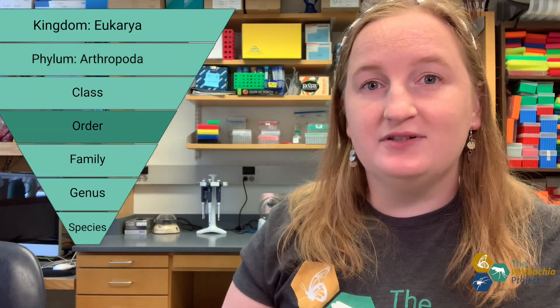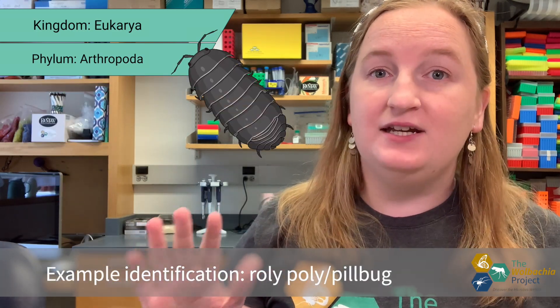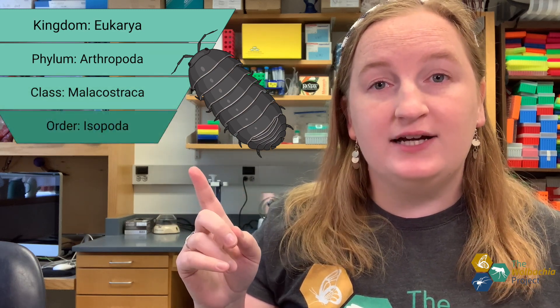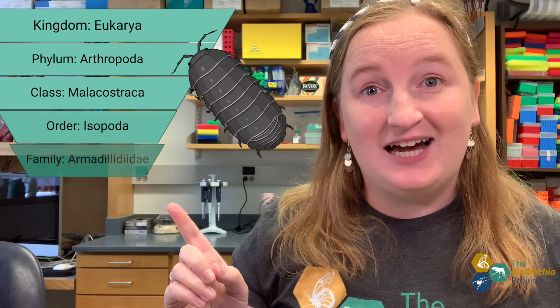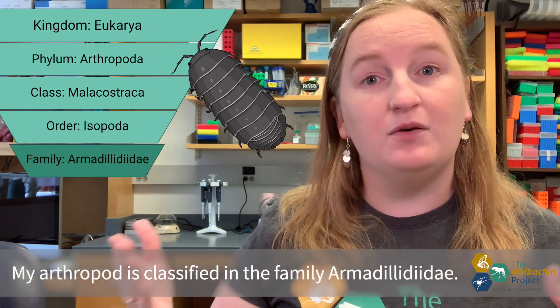Let's look at some examples. Let's say that I collected a roly-poly or a pill bug — these are really common in dark, damp places. I know that it's an arthropod belonging to the phylum Arthropoda. With a little bit of research, I know that it belongs to the class Malacostraca. I know that it's an isopod belonging to the order Isopoda. And because I'm confident that it's a pill bug — they're really unique and easily identifiable — I know that it belongs to the family Armadillidiidae. So I would say my pill bug is classified in the family Armadillidiidae.